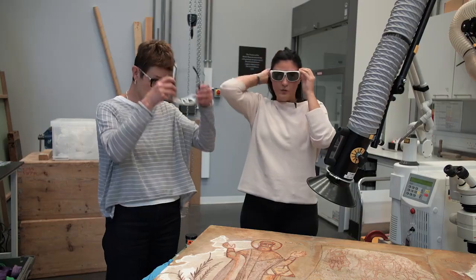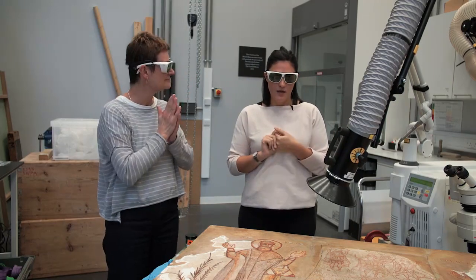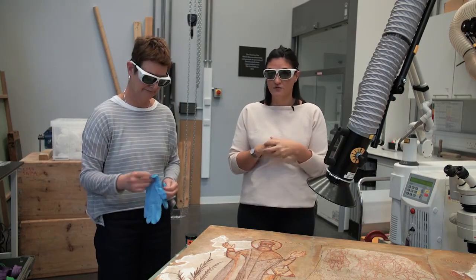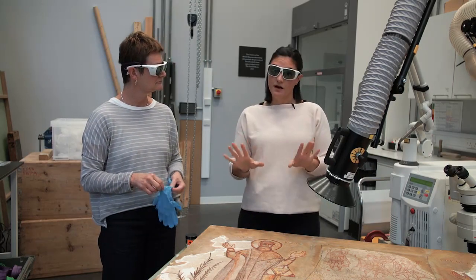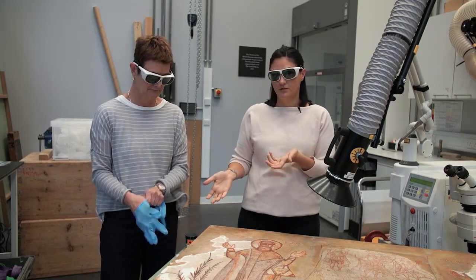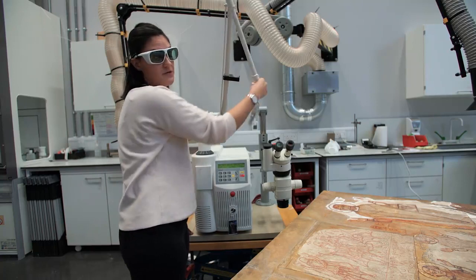We are wearing goggles because when working with a laser it's always good health and safety practice. We also have extraction here to protect us from inhalation of any fumes coming off the solvents we are going to be using. I'm not going to be wearing gloves because I'm handling the laser itself, but Tracy will be wearing gloves as she will be interacting with the solvents. We hit ready twice and once we hear that sound, the laser is ready to be used.